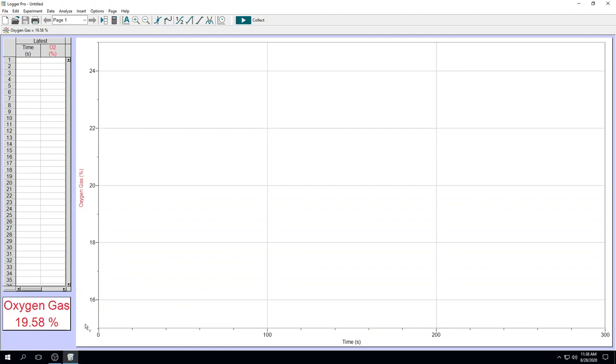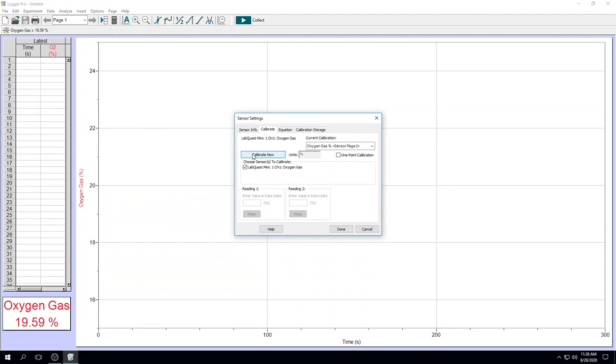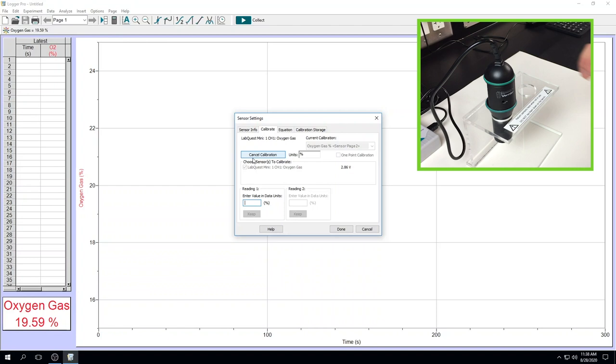For the first part, under experiment, calibrate, click calibrate now. In the first reading, using the provided wooden stick, we press into the hole in your oxygen sensor. At this point, you would see the voltage on your screen decrease to close to zero.